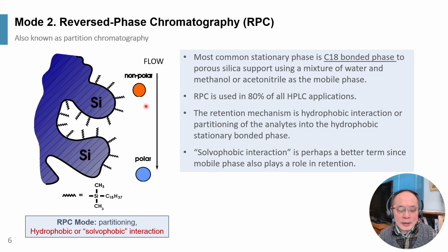And in this case, the non-polar analytes would be retained by higher partitioning coefficient into the hydrophobic stationary phase. In reverse phase chromatography, the separation mode is partitioning or hydrophobic interaction.